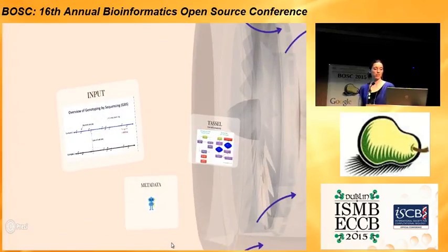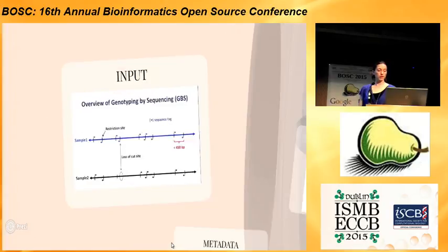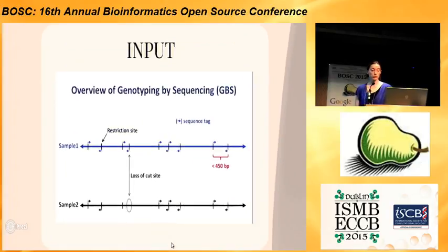The Biospectra-by-sequencing project comes from something that was called genotyping by sequencing before BBS. That was a new method for sequencing organisms developed at Cornell University in New York State. Basically what it gives is a very cheap and efficient way of sequencing only part of a genome. The interesting part is that if you use the same restriction enzyme, you always get the same sites from the same species, and then you can compare and do population genetics with those data.